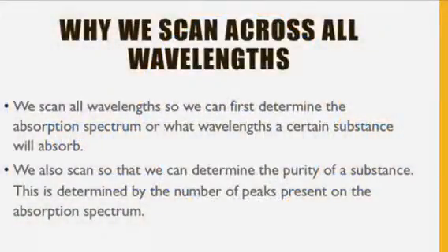We scan all wavelengths so we can first determine the absorption spectrum, or what wavelengths a certain substance will absorb. We also scan so we can determine the purity of a substance. This is determined by the number of peaks present on the absorption spectrum.